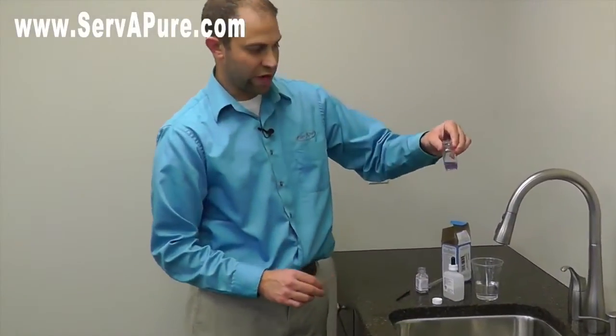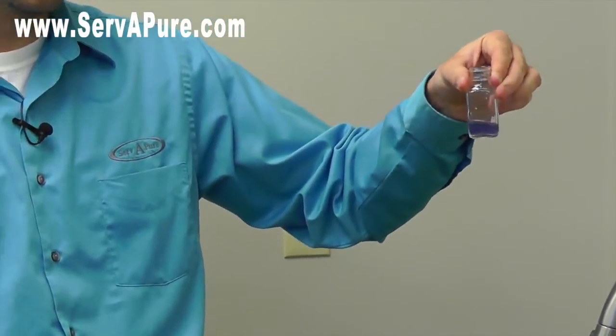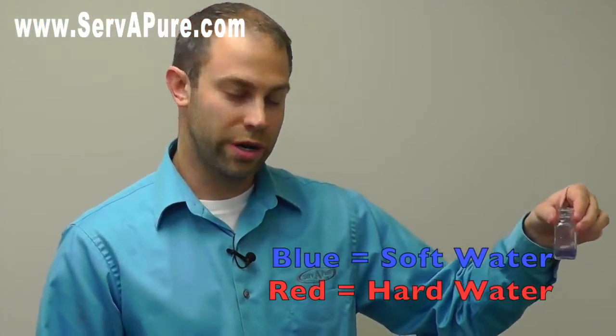You can mix it around a little bit. We do have a water softener here and it looks like it's working because it's blue. Anything you get that's kind of a purplish color to a blue color will indicate soft water.